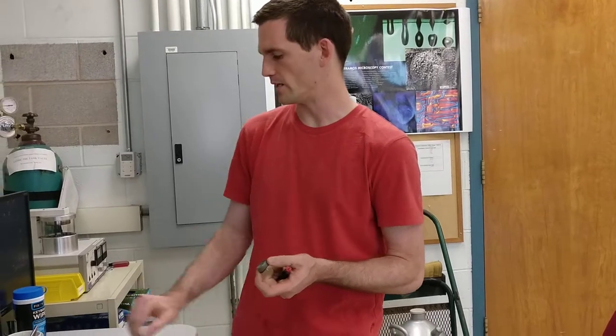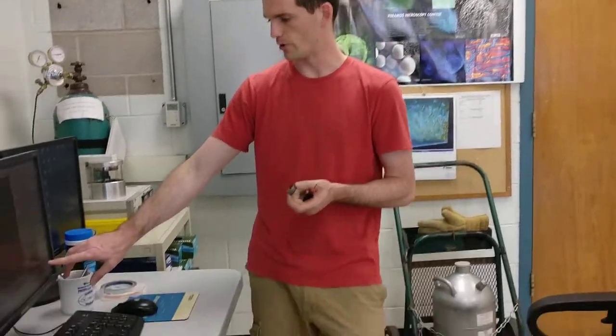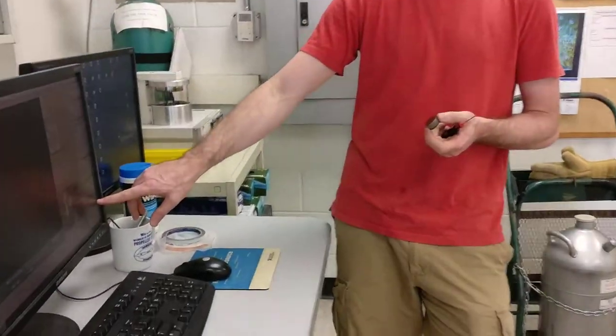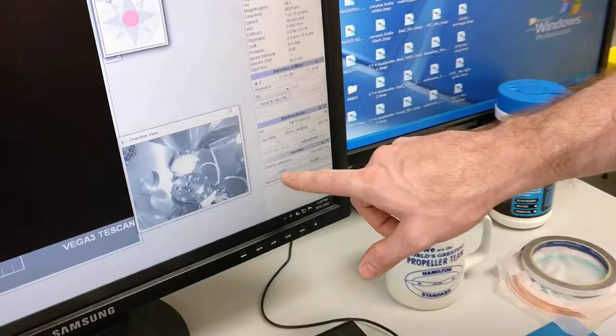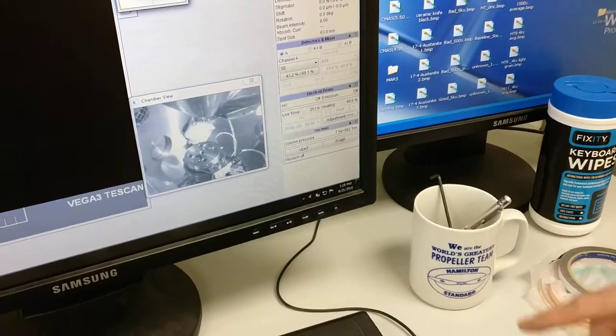We're ready to put the sample in the SEM. We want to make sure that it's vented, so we can click this vent button and hit OK.